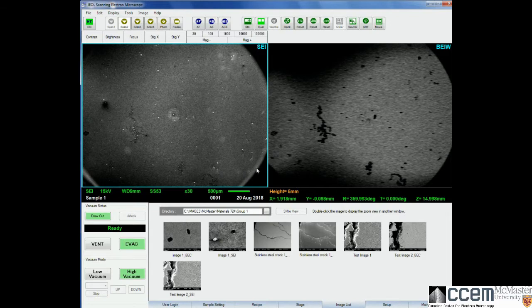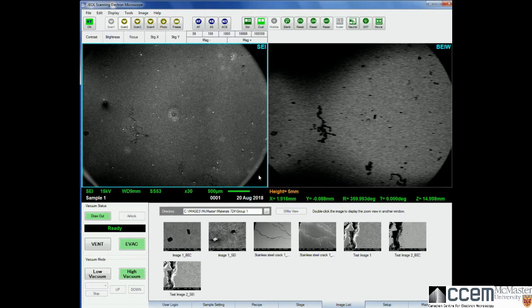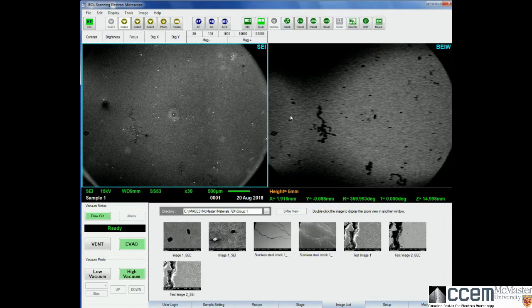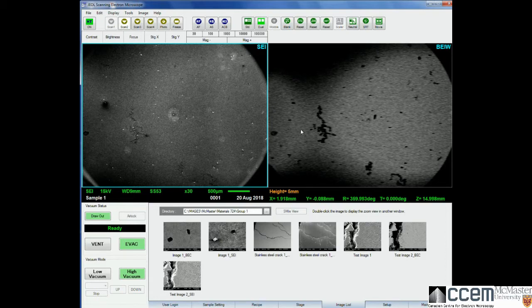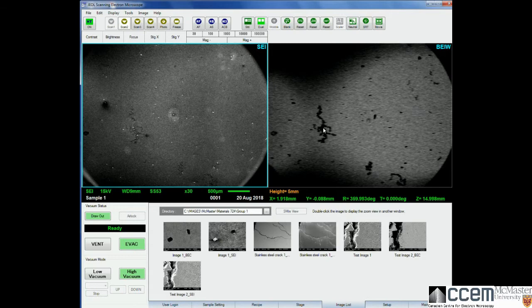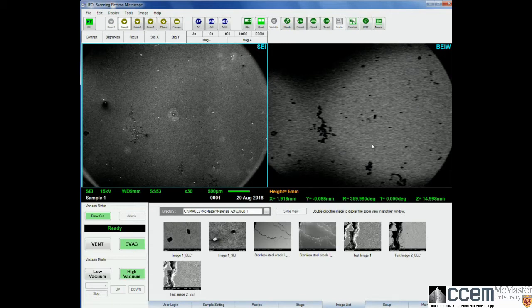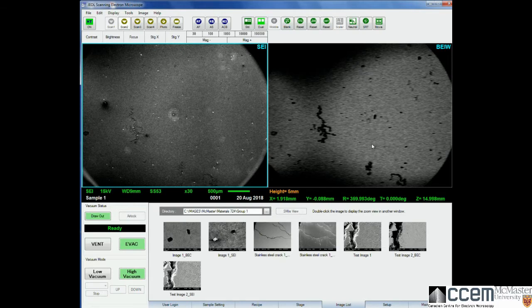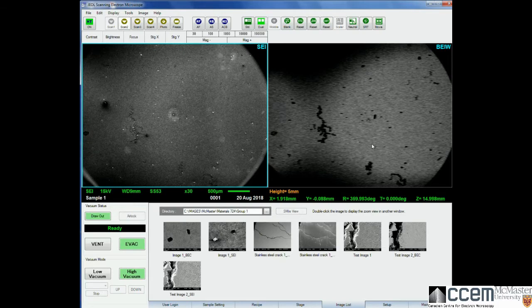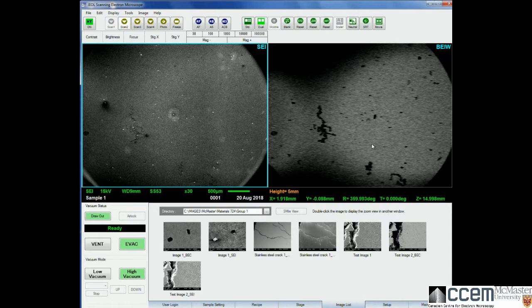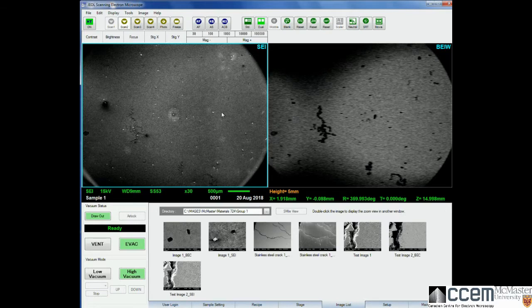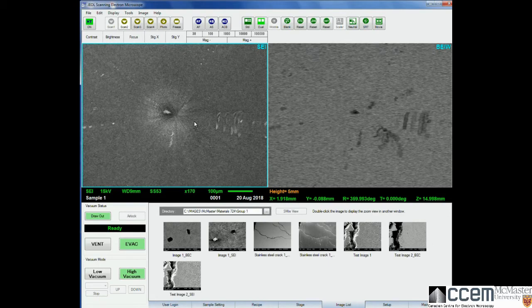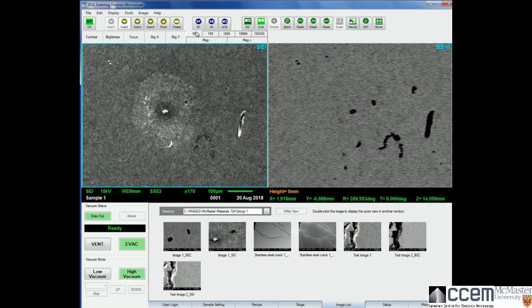You'll see here that we see the final aperture and actually the hole through the backscattered detector at the edges. Now this doesn't look like it's very evenly illuminated, so if this happens you need to contact the technician, because we have to adjust the gun to get it properly centered, or it might involve adjusting the aperture as well. Adjusting the gun and the aperture is not done for basic users — we'll show you that when you're more advanced.